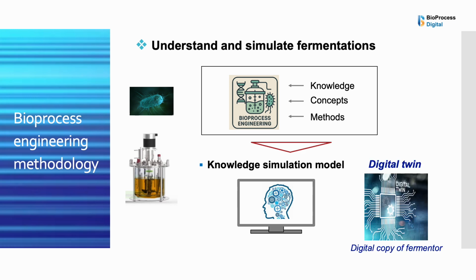These models serve as digital twins, virtual representations of fermenters, that enable in silico experimentation under various operating conditions. Typically developed from laboratory-scale experimental data, simulation models play a pivotal role in advancing scientific insight into microbial transformations. Furthermore, they play a critical role in the optimization of operating modes and process parameters, supporting the achievement of maximal productivity or minimal production costs.